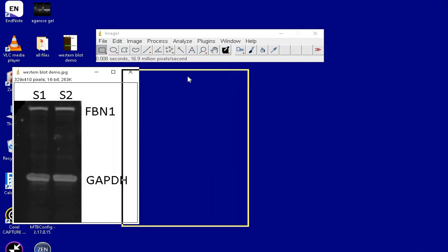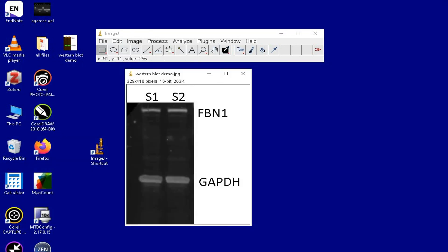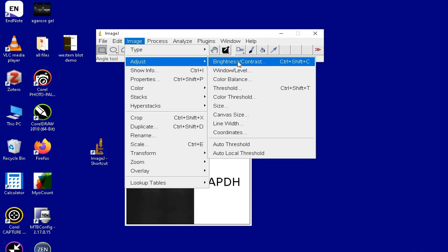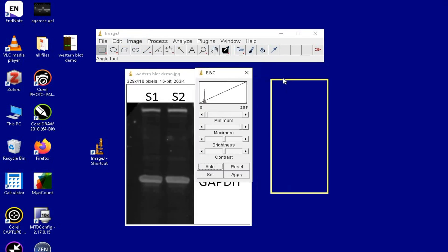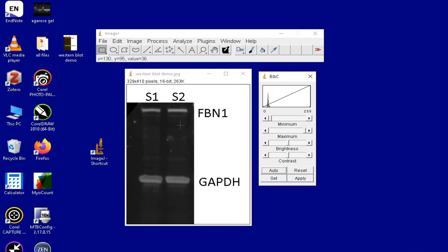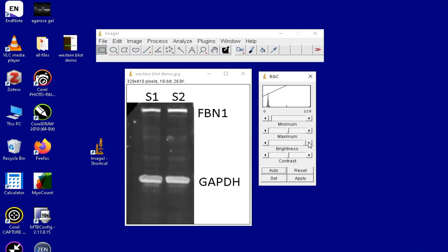The bands in the blot can be made more visible by changing the intensities. Manually change the brightness and the contrast according to your choice. Once selected, this window can be closed.